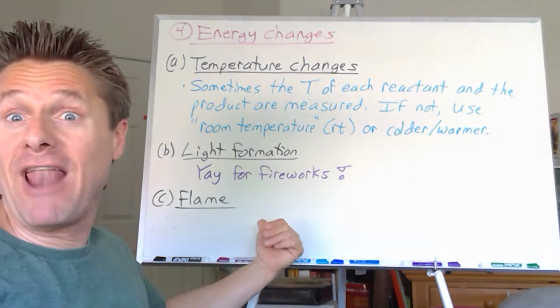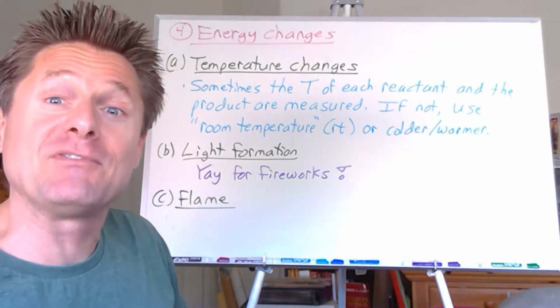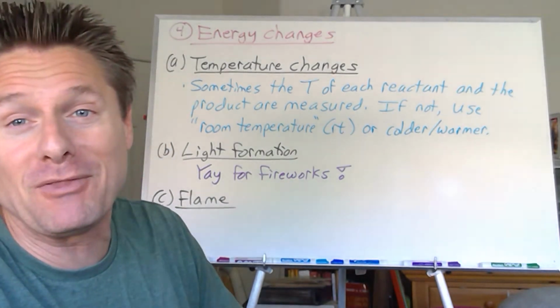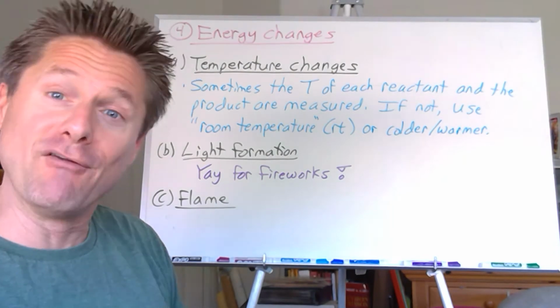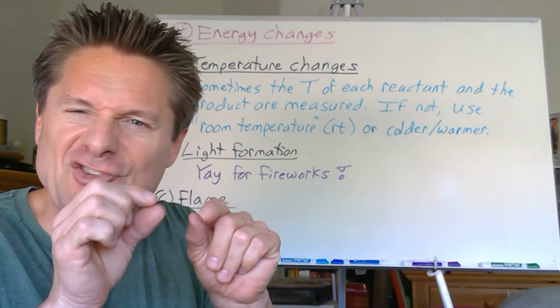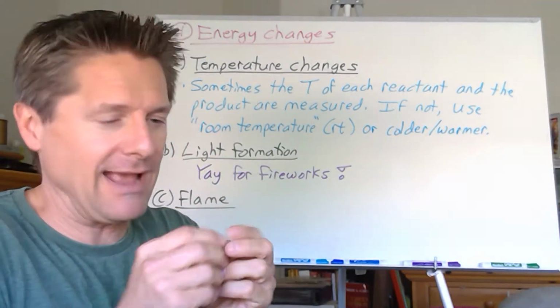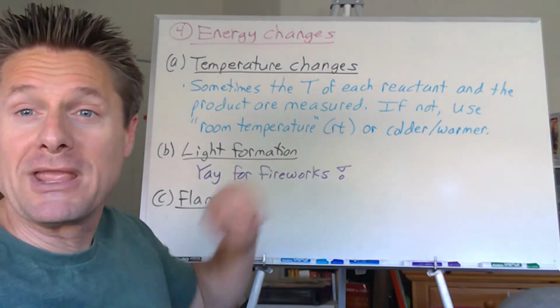My favorite, flame. I've blown myself up in some flame a few times. It's a pretty big indicator that there was a major chemical reaction going on with a lot of energy released, very highly exothermic. And it hurt. So we try to avoid flame formation in undergraduate laboratories. We have a few labs where we take tiny chunks of sodium or potassium and put them in water. Especially with potassium, you get a little lavender flame. So it's all kind of fun. These are usually pretty obvious and easy to do.